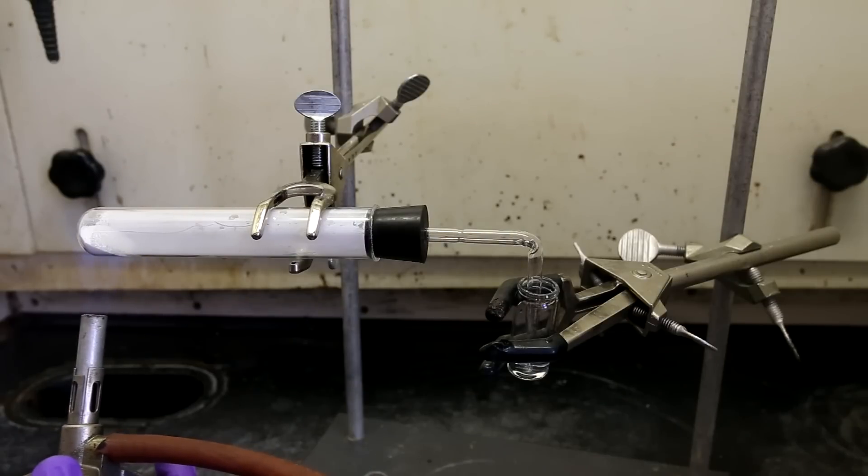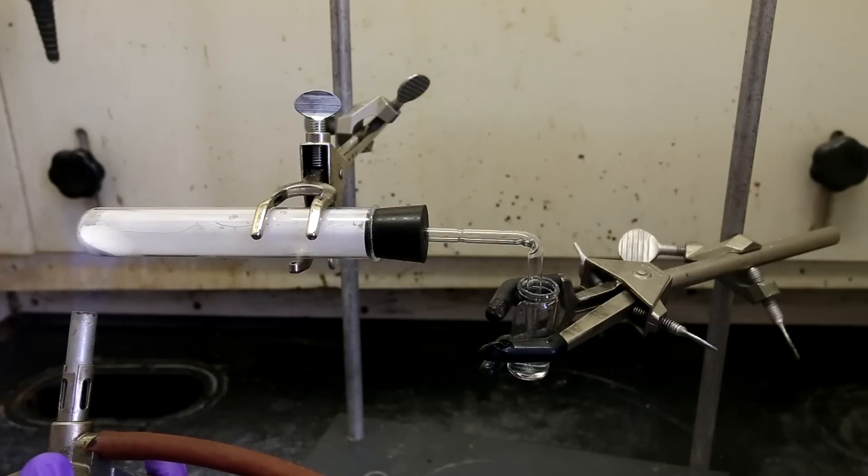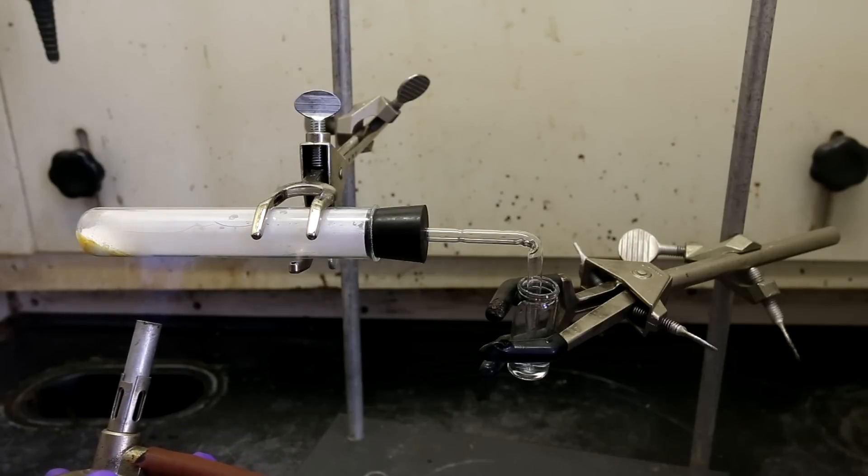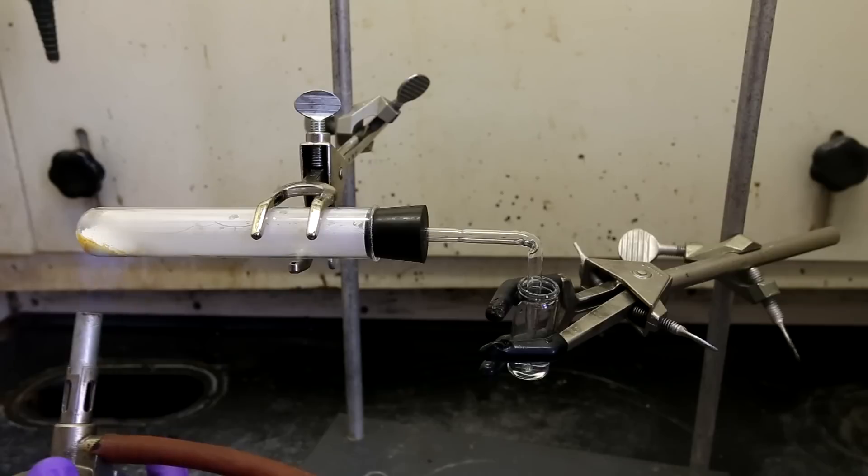Out of the stopper is actually a Pasteur pipette tube that I bent to a 90-degree angle using a Bunsen burner. This leads into a small dram vial containing some water. The idea here is that the lysine can be heated to high temperatures to decarboxylate as much of it as possible.